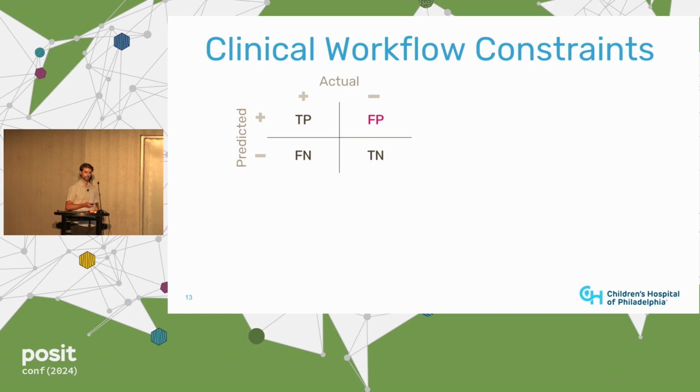And in the context of the clinical lab, the false positive translates to a lot of extra work that somebody now has to do. They probably have to rerun that test to make sure that they get the same weird result, which delays all the other tests in line, and which has downstream impacts on all those patients and the clinicians waiting for those results.